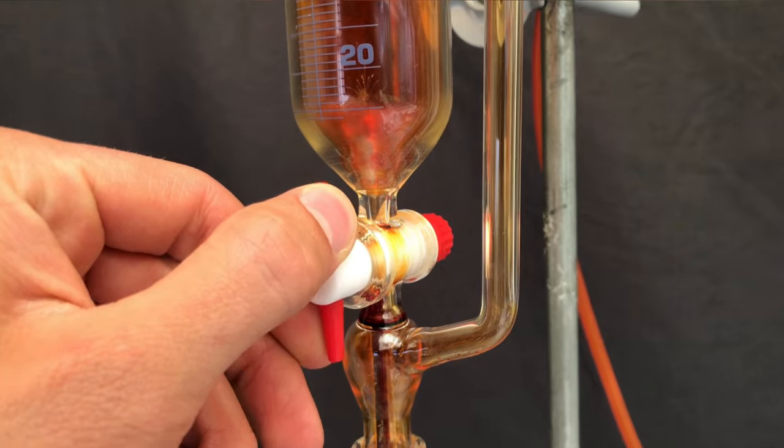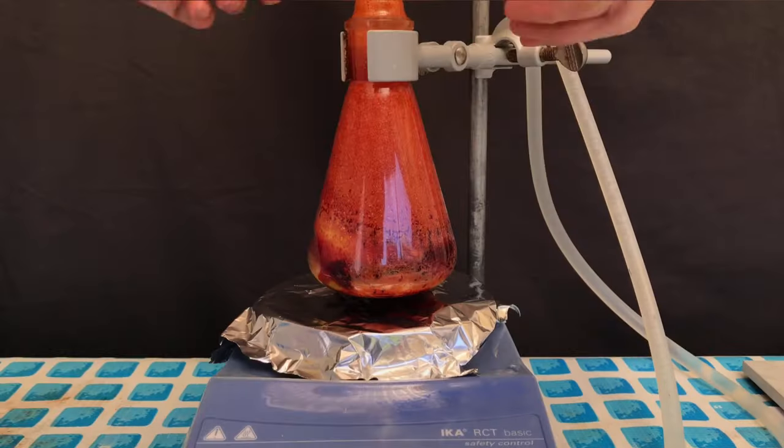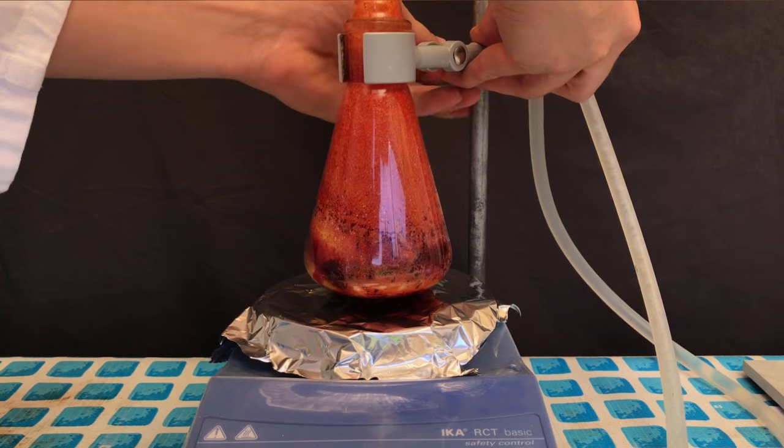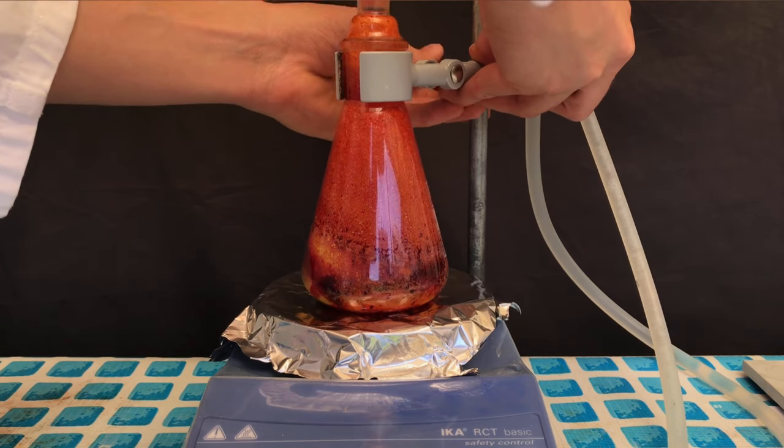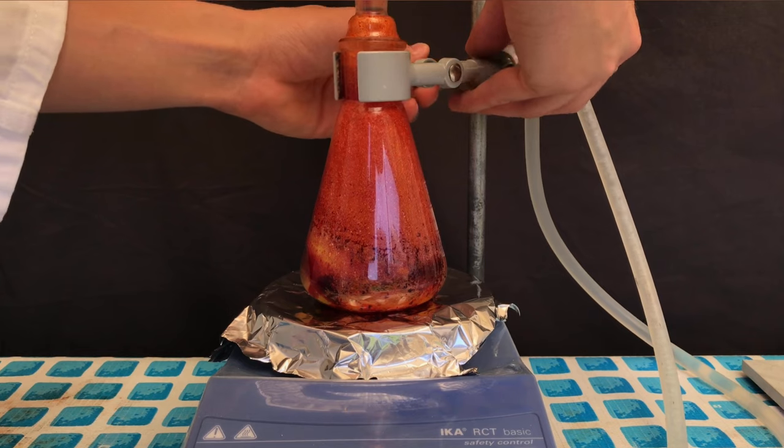In the flask, we now have a mixture of phosphorus tribromide, phosphorus pentabromide, elemental phosphorus, and leftover bromine. Our goal is not to have a mixture of this, but only phosphorus tribromide.